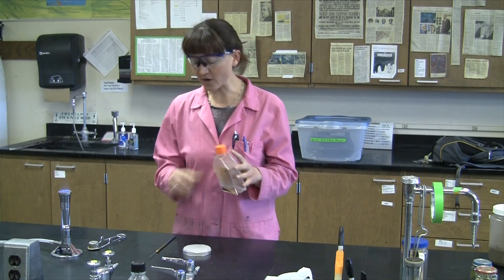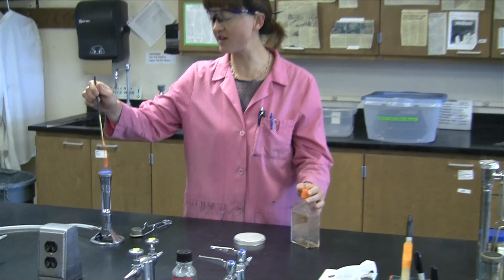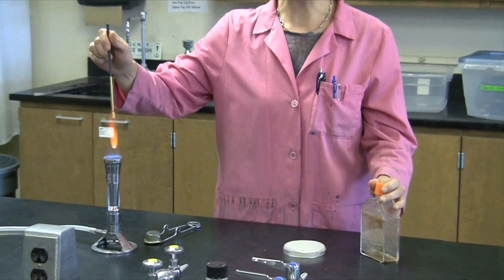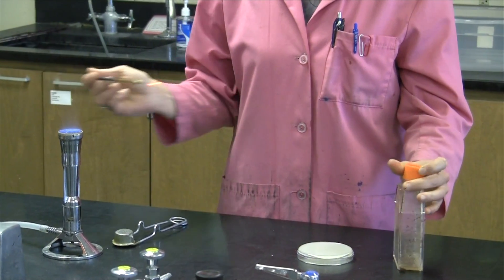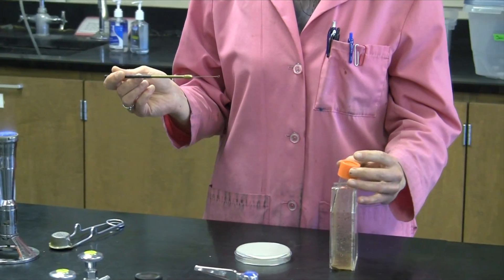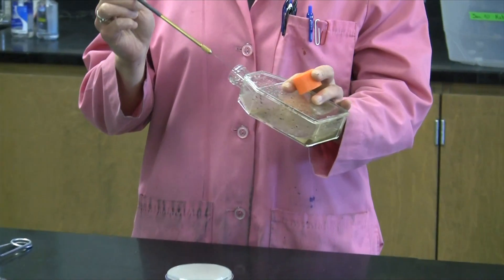So we'll get it cultured by going ahead and T-streaking from the nitrogen-free broth onto the agar. Just a single loopful of this nitrogen-free broth should be plenty to allow us to streak the plate.